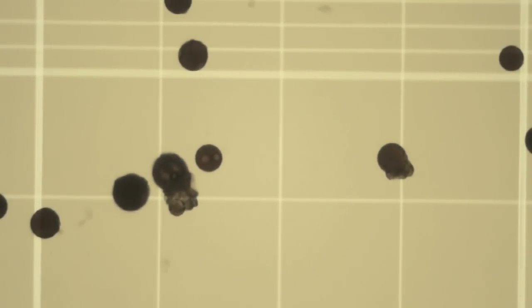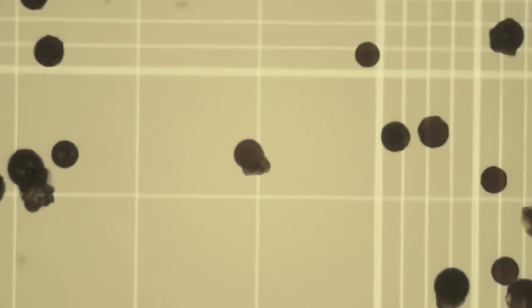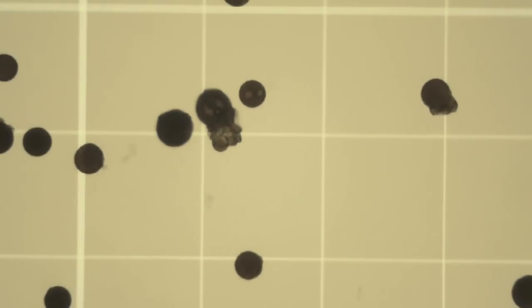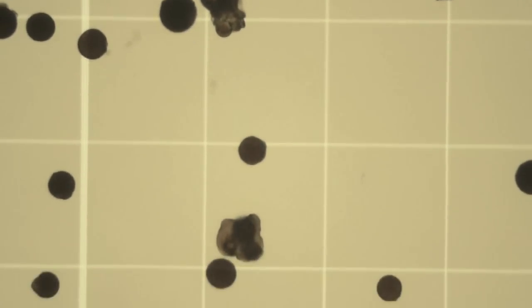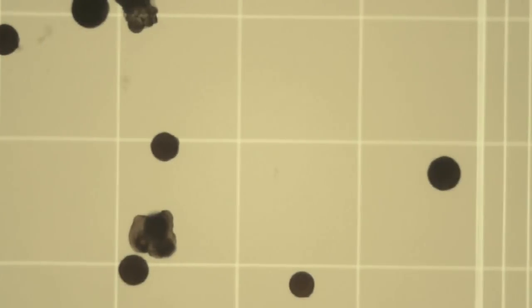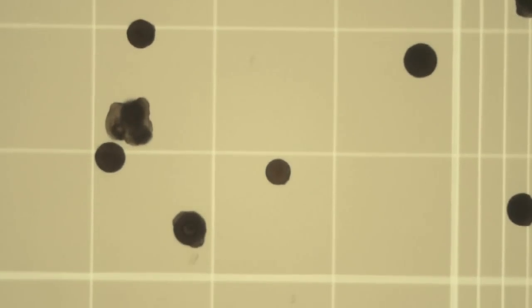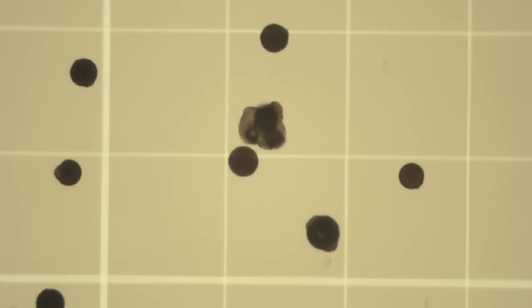Now on the first row, there's 1, 2, 3. I'm not going to score that blob there as a particle. So 1, 2, 3. I'm going to score that one as 4. Coming down to row 2. Now that particle is mostly in, so that's 5. Okay, the next row, 6. I'm going to score that blob as 7 and 8. There's 9, 10, 11, and 12. So lower level is 12 particles.